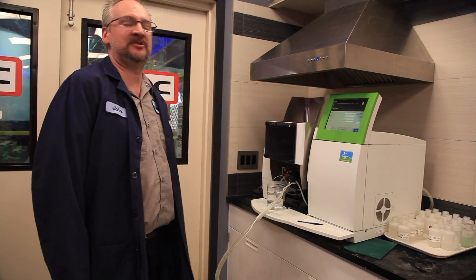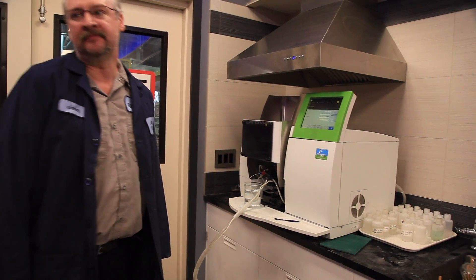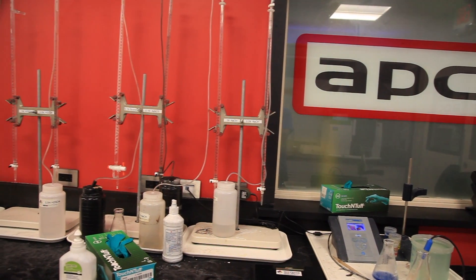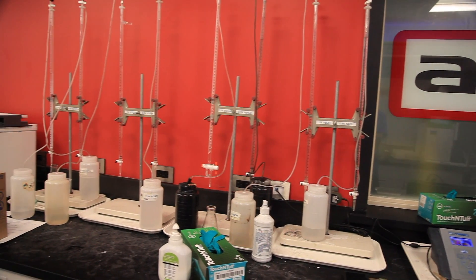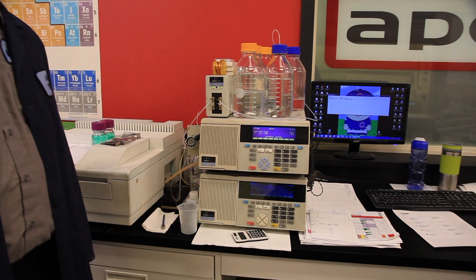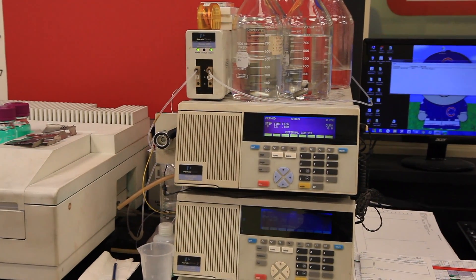We have an atomic absorption spectrophotometer that's used to analyze metals in solution. Over here we have a bunch of titration stands and burets that we use to analyze different heaters and acid activators, as well as nickel concentrations in our nickel baths. Here we have a HPLC that's used to analyze organic components that are used in our nickel plating solutions.